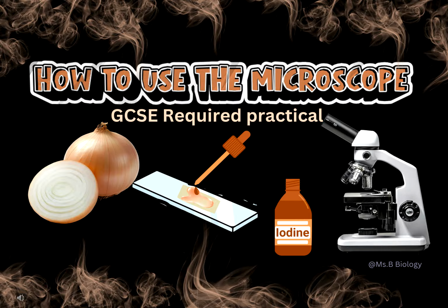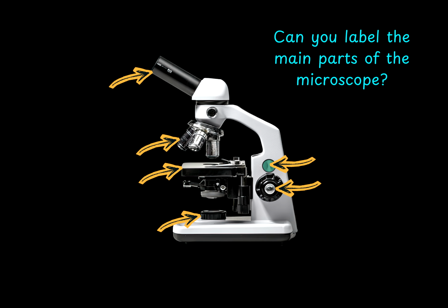In this video, we'll be looking at how to use the microscope to observe the prepared slide. So as usual, grab your book and grab your pen and let us begin. Let us now label the microscope.